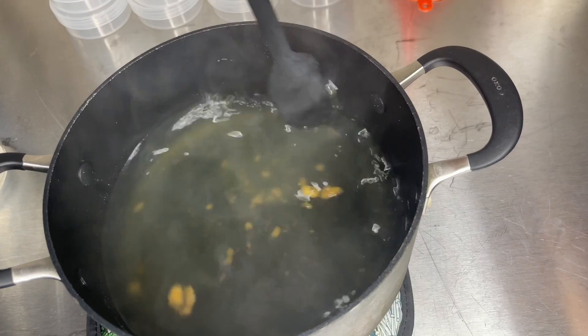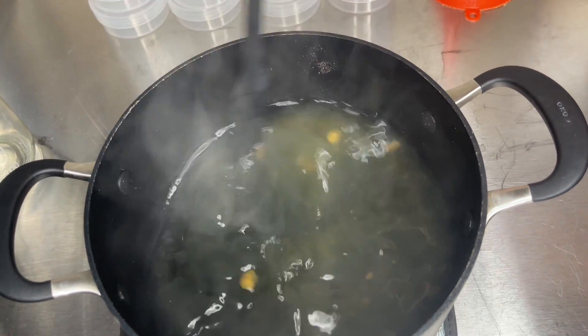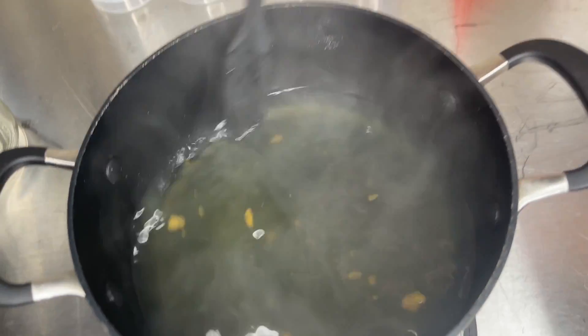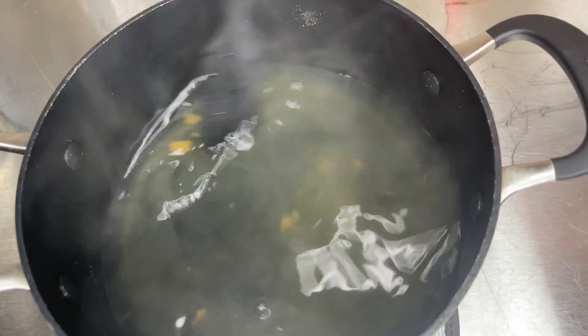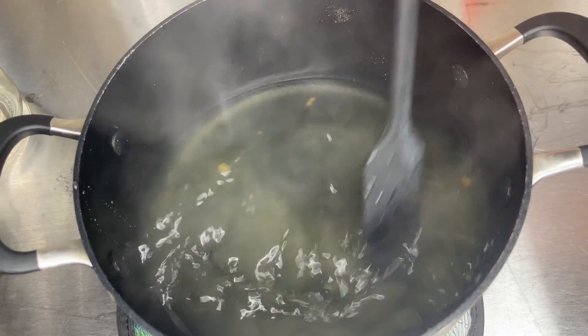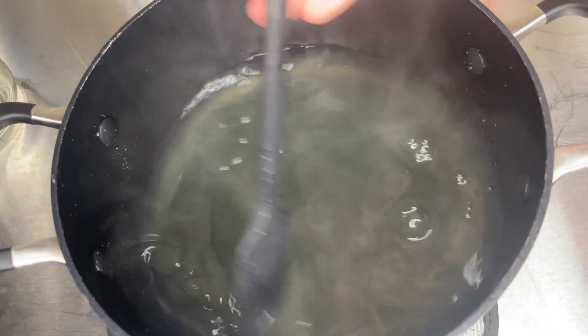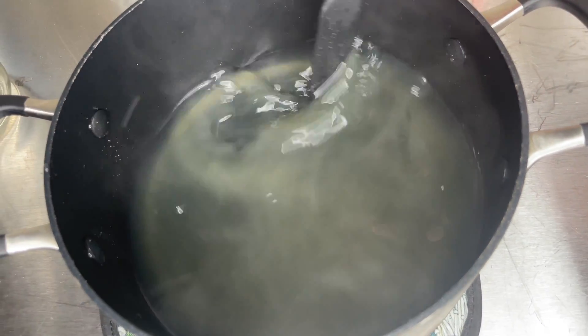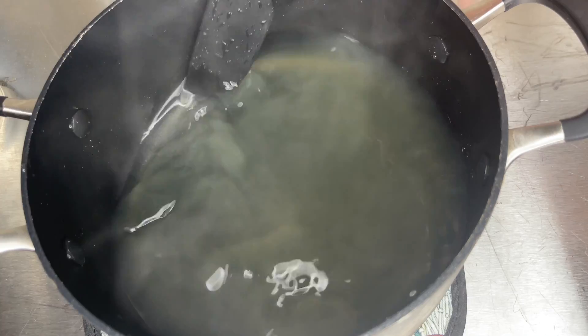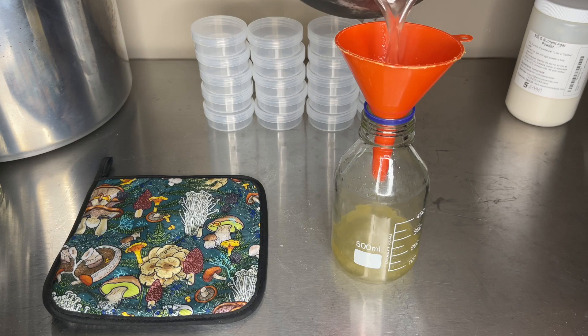You don't want the water to be boiling when you add in the agar because it can start cooking the powders before it can be dissolved. I like to bring the water to a boil, then turn off the heat, and then add the nutrient agar powder and stir until it is completely dissolved. Once the pre-mix has dissolved you should start to see the solution clear up. Then I pour the solution into a media bottle so that it can be poured into the containers.